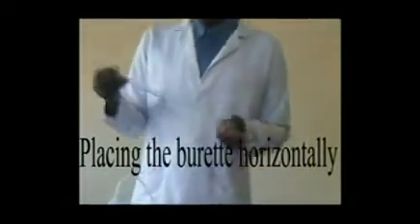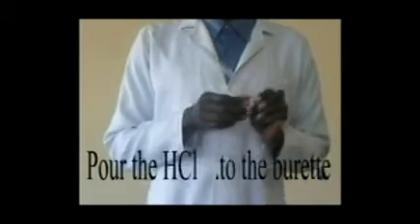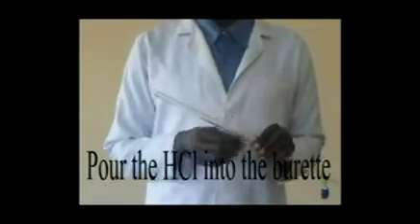Rinse it horizontally, then remove the acidic solution. Take the burette and hold it at an angle of about 45 degrees. Then pour the acid into the burette.